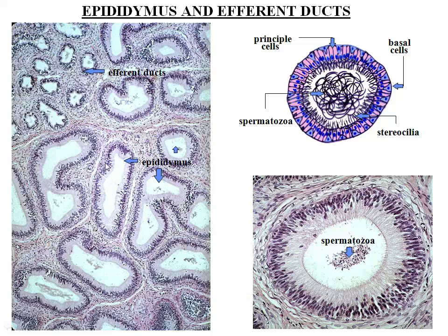The epithelium here is pseudostratified columnar, and here it is simple cuboidal, and the tubes are small and irregular. Here they are wide tubes with a lot of secretion over the surface.